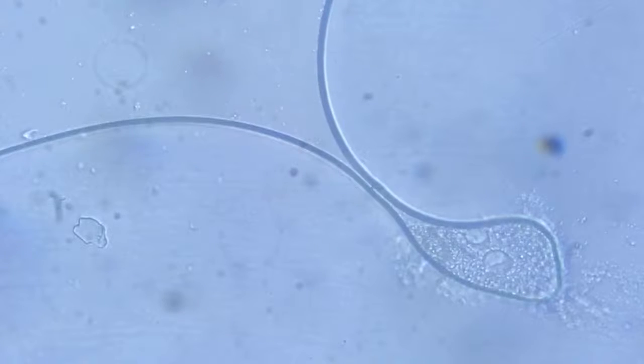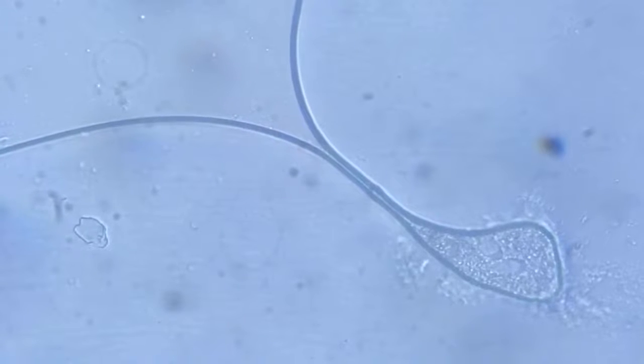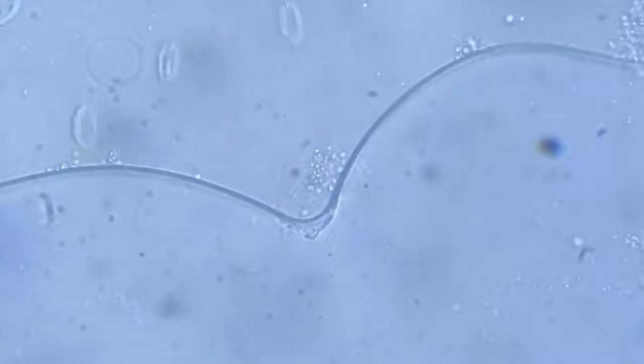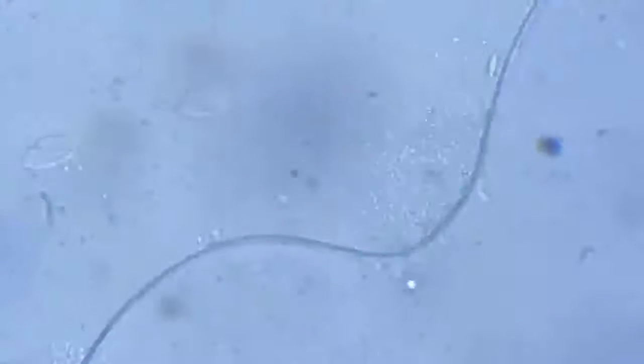The contractile vacuoles are being squeezed in. These euglenids are still living. They are least bothered about the environmental change and stress. They haven't yet felt the pinch of it.